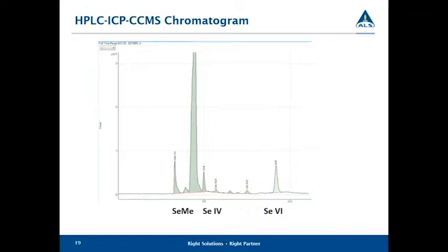And these contribute to what I refer to as a selenium gap. It's a gap, but it also gives you information on what type of species might be present, and also what you do and don't know about the various species in that sample. Often you can dive deeper and try to find some of these unknowns. And in some cases, if an unknown is a significant contribution, you obviously want to find out what it is. That's a continuous challenge for analytical chemists.